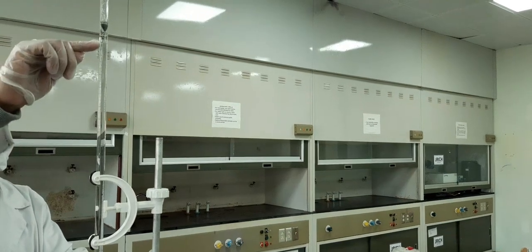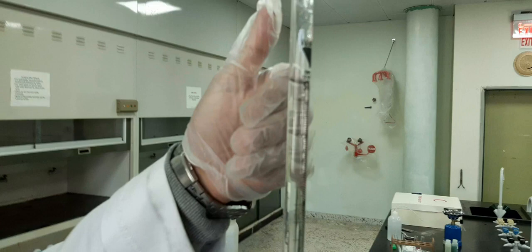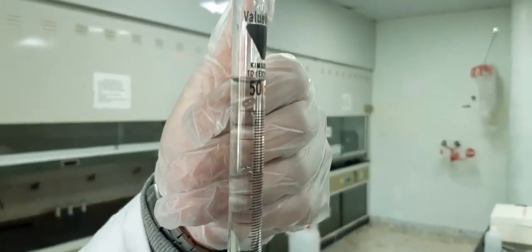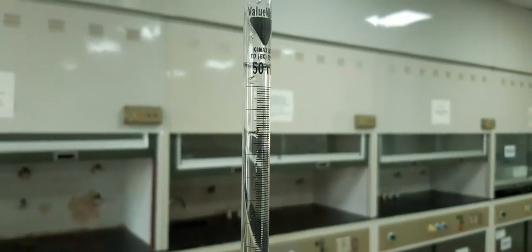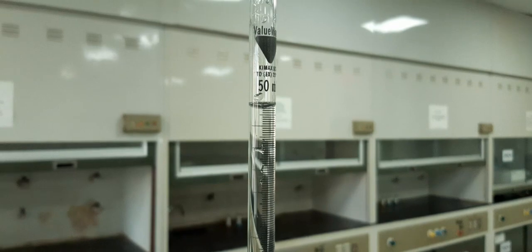If you can see the line, the 0 starts from here. This is the 0 position. So we should remove some solution to make it 0. Look at this. We will open the stopcock, and the solution will go down. When it reaches 0, I will stop it. Now this is my start point, which we call the initial volume. Now my base solution is ready.